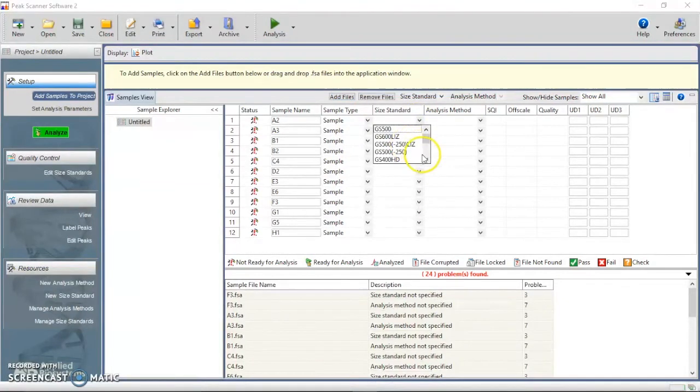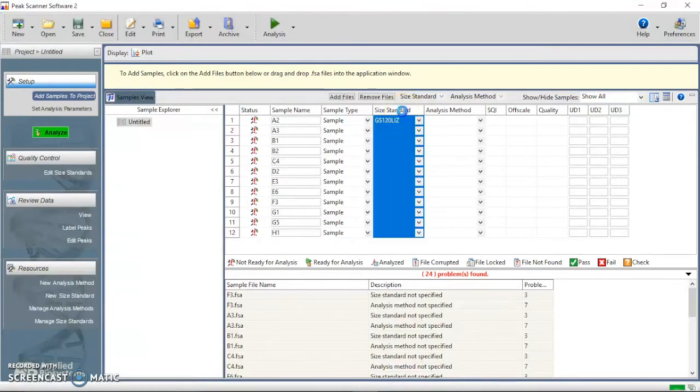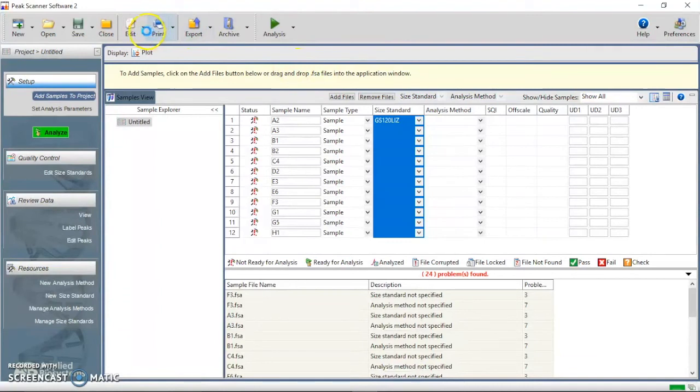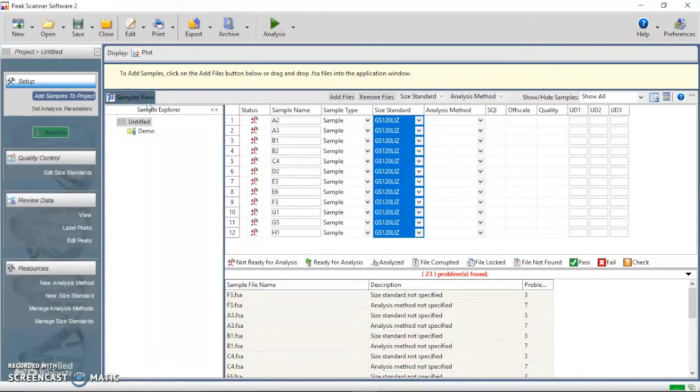Go to the first row under Size Standard, choose the standard used in the experiment. Then click Size Standard, choose Fill down under Edit button to fill in the sizes for all samples.